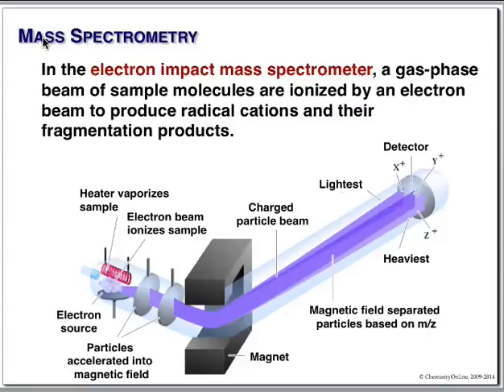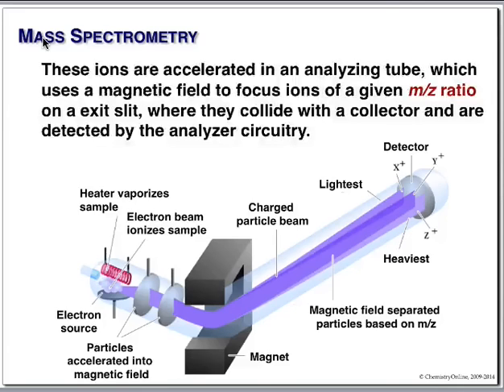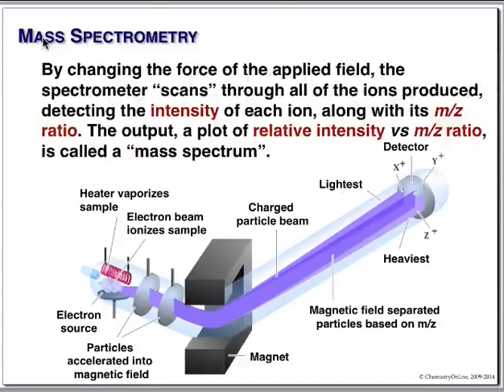Now, the way you actually do this is slightly different. Your magnet isn't a permanent magnet, it's tunable. So you take it and you increase your magnetic field. As it does, this thing swings back and forth, and you read the peaks one at a time. What we're going to get here is an m/z ratio, mass to charge. As far as we're concerned, charge is always one. So this is simply the mass. When you get all this together, you look at intensity versus mass, and you get what you call a mass spectrum.